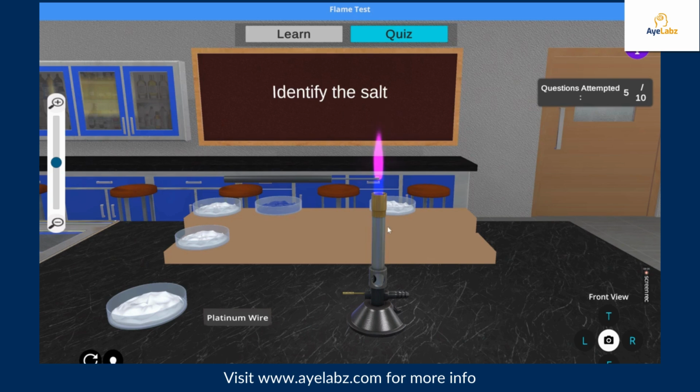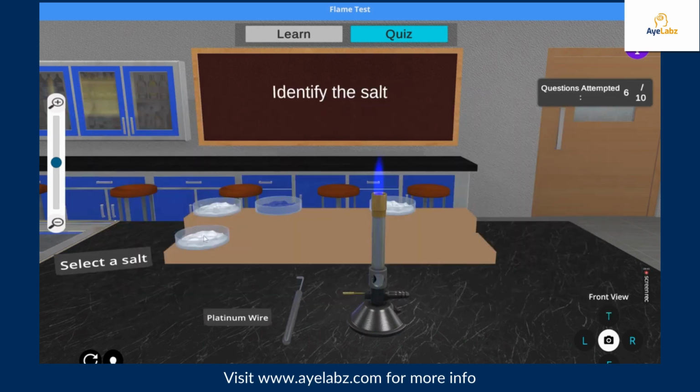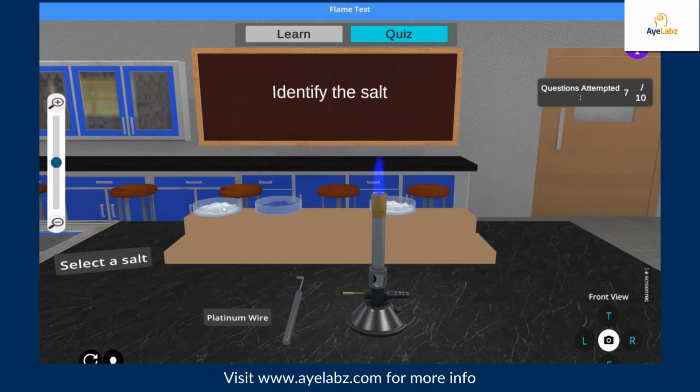It's violetish. It must be potassium. As the sixth salt, yellowish red. Which salt must it be? I think it must be sodium.